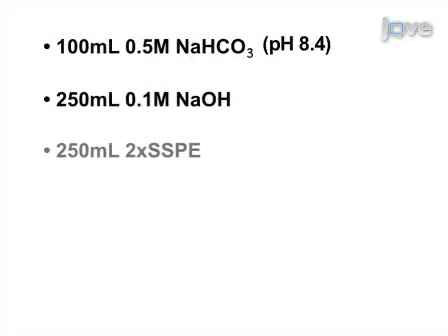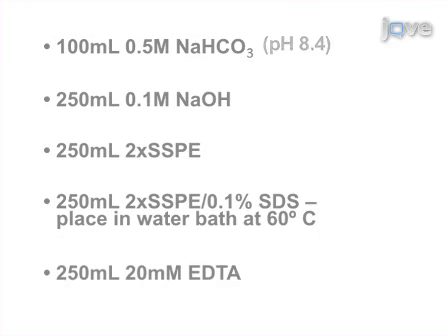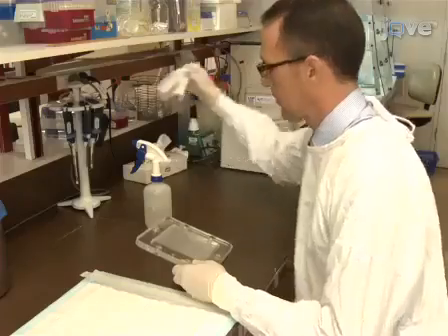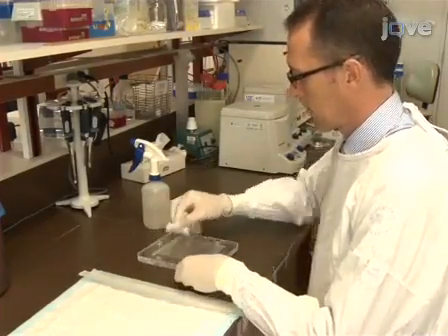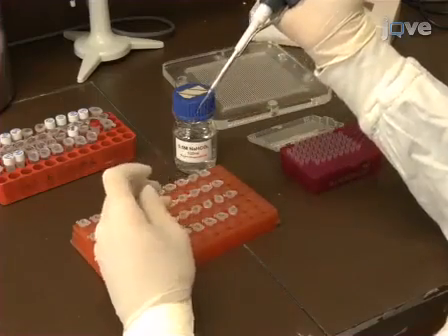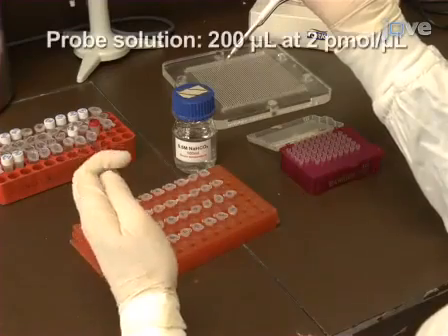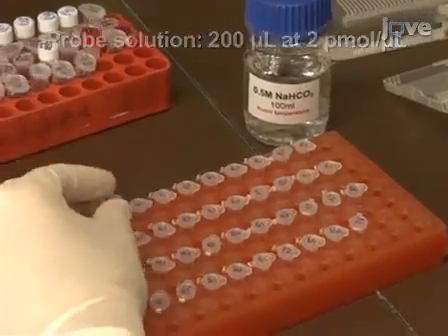Before beginning, prepare the following solutions according to the written portion of this protocol. To prepare the membrane, preheat the oven to 60 degrees Celsius and clean the mini blotter with 70% ethanol. Dilute the oligonucleotide probes in 0.5 molar sodium bicarbonate to a final concentration of 2 picomoles per microlitre and a volume of 200 microlitres.